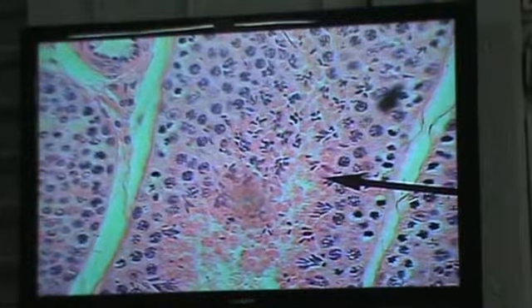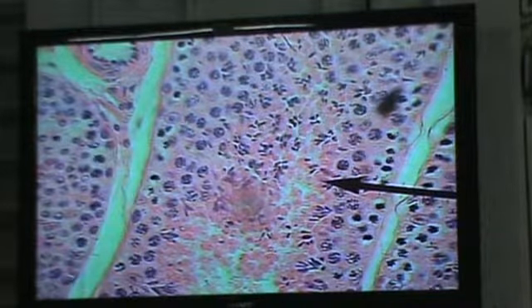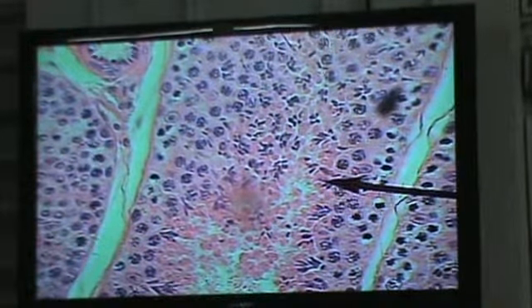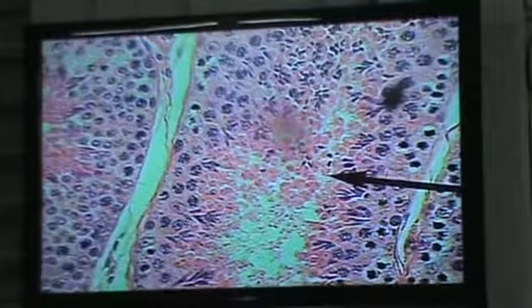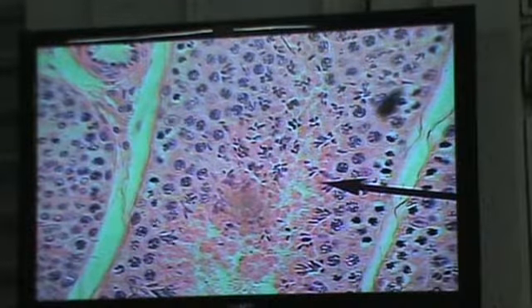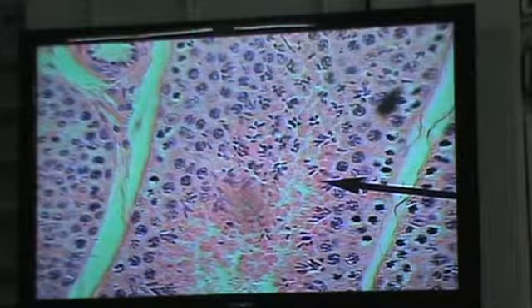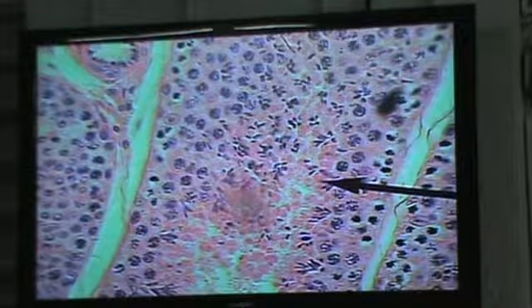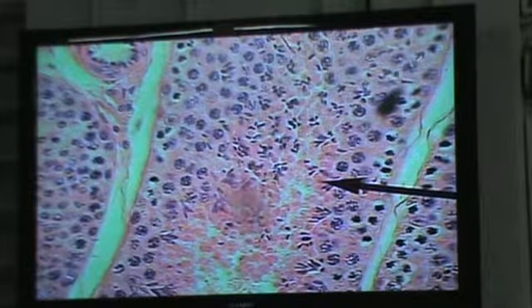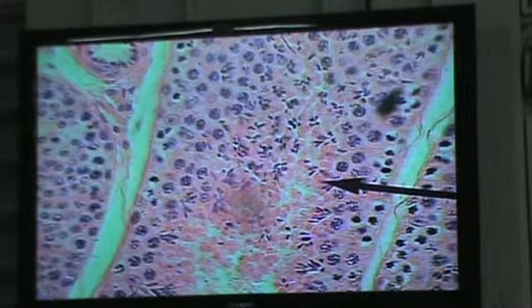Now, what you will observe is that you cannot see the tails of the spermatozoa to any great degree. There's still a lot of cytoplasm around it. Maybe there's one or two tails right here. So what's occurring right here now is the process of spermiogenesis. So these that we saw in the exam are not spermatozoa, these are spermatids. Because we see the head of the spermatozoa, but there's still a lot of what? Cytoplasm around. So spermiogenesis has not fully occurred right there.